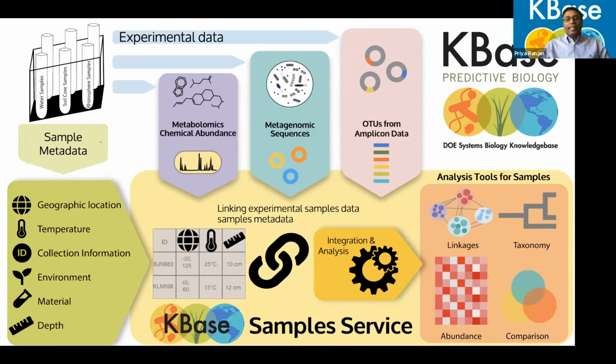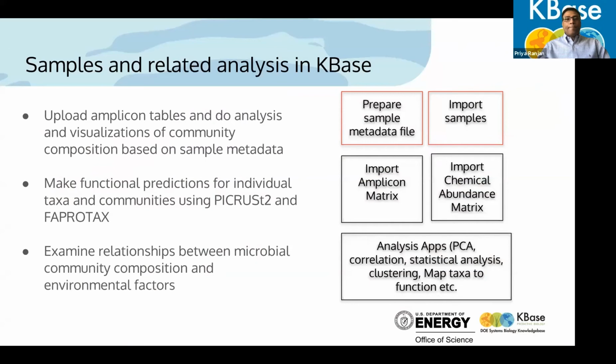This is a new thing in KBase. Before this, we didn't have this concept of samples. It's a completely new thing, but it's a way to organize all of your data. And soon, I think every piece of data that comes into the system will have some linkage to a sample. Again, it helps you do a lot of analysis, and we have some pretty ambitious goals there. But right now, what can you do once you upload samples in KBase? You can upload amplicon tables and connect them to samples. And that's the only way to upload it.